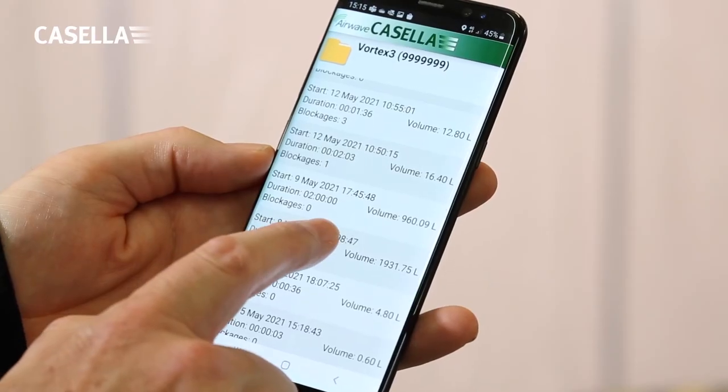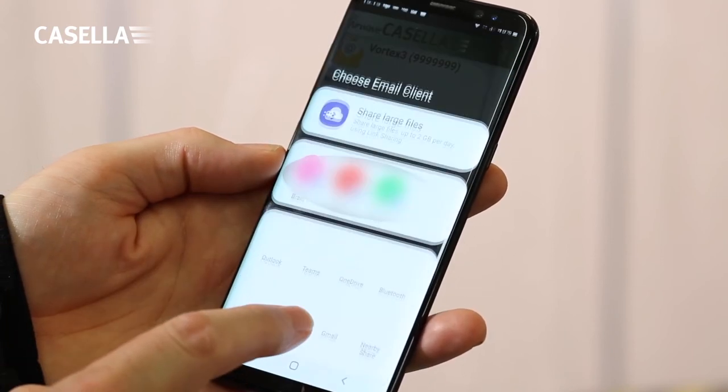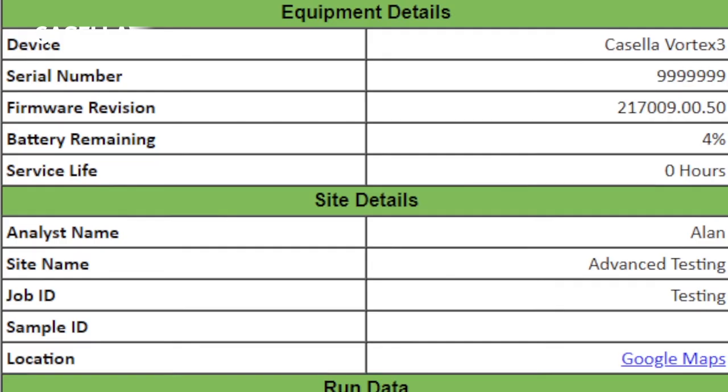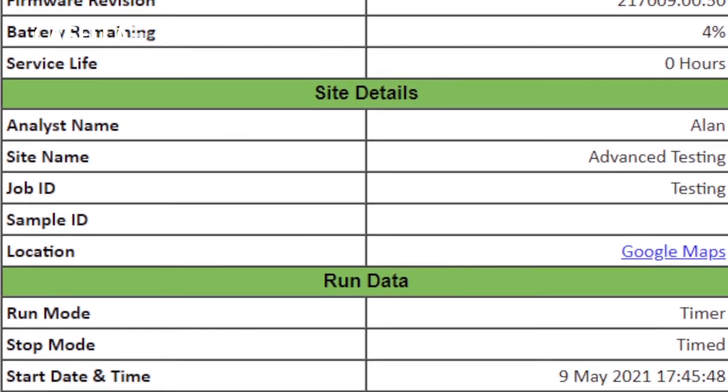From the Casella Airwave dashboard view, you can download air sampling runs stored on the Vortex 3 and make notes on your sampling activity. Highlighting individual sampling runs also provides the opportunity to copy the results to a clipboard and create email options to assist with sampling record maintenance and circulation.